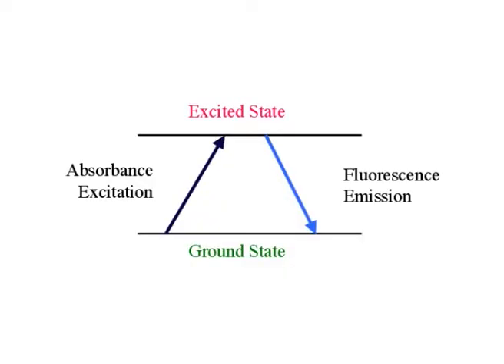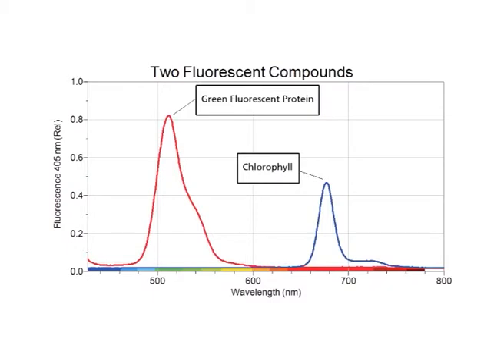This technique is widely used in the fields of research, biochemistry, medical, forensic, industry and pharmaceutical companies, etc. The contribution of fluorescence spectroscopy is quite valuable in the field of analytical techniques. In the examination of questioned documents, this technique is also found instrumental for analyzing ink and differentiating between two inks. This technique often proves conclusive and gives definite results. The spectroscopic findings are quite convincing and usually believed in the legal domain also.